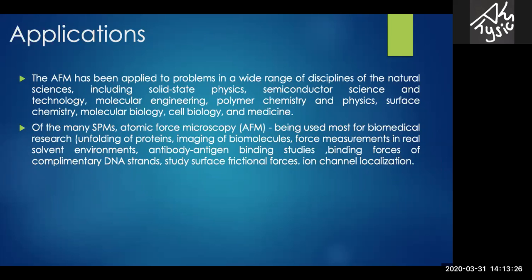Applications. The AFM has been applied to problems in a wide range of disciplines of the natural sciences, including solid-state physics, semiconductor science and technology, molecular engineering, polymer chemistry and physics, surface chemistry, molecular biology, and cell biology.